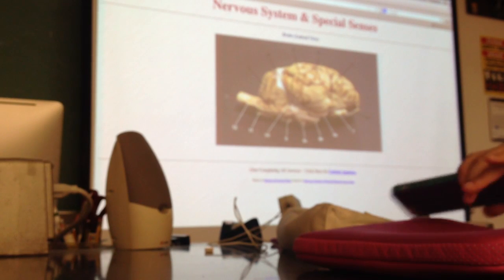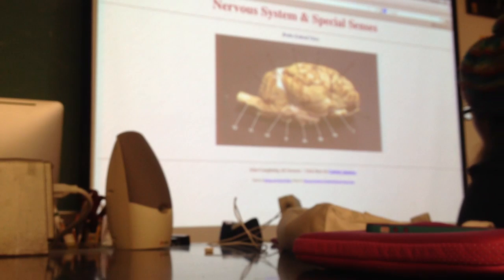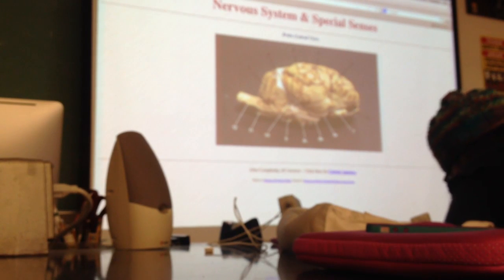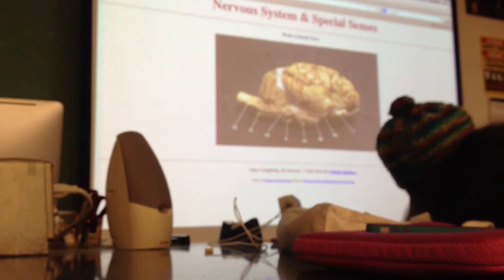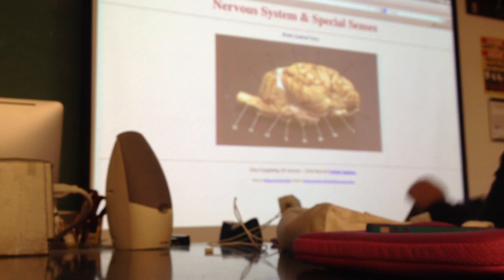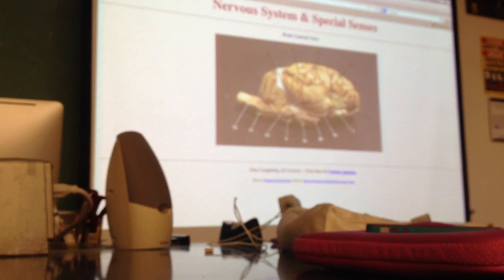You don't need to know the cranial nerves, you just need to know the ones included on the dissection model list, so simply the olfactory bulb, optic nerve, and optic chiasm, all right? With that said, you will probably see cranial nerves present, so feel free to try to guess what they are if you see them. So again, here we have our olfactory bulb, then we have our optic nerve coming out here.